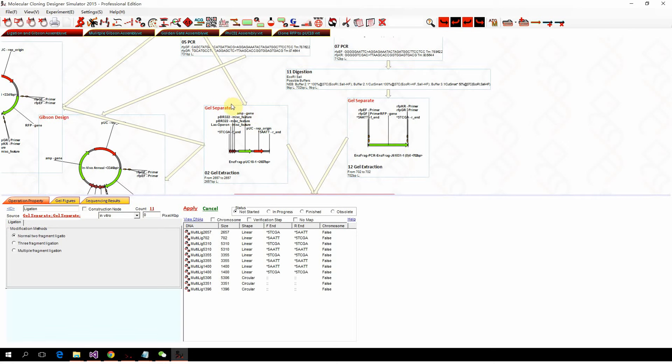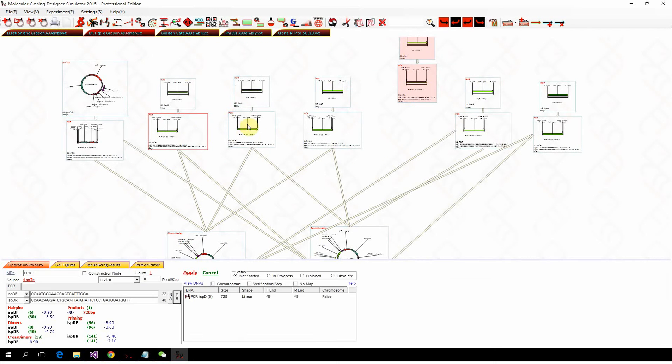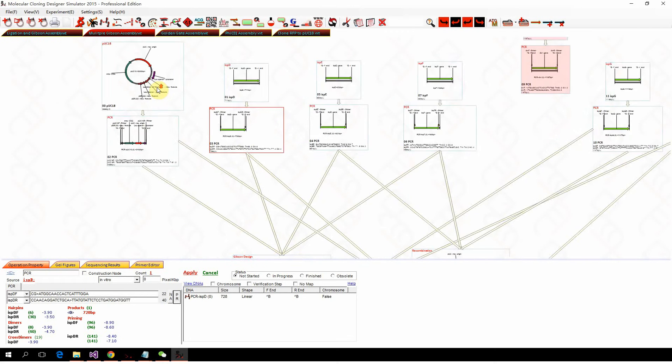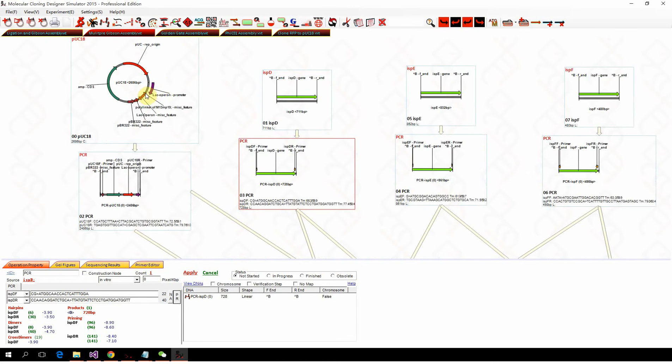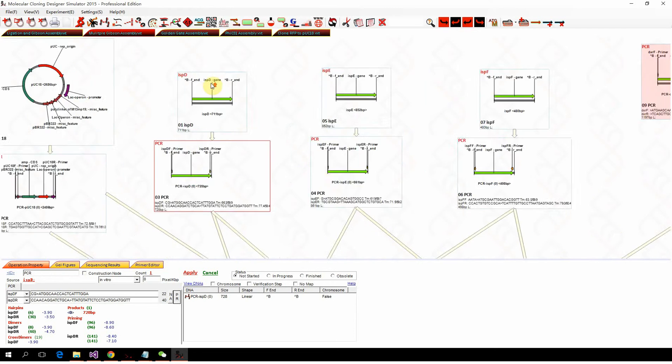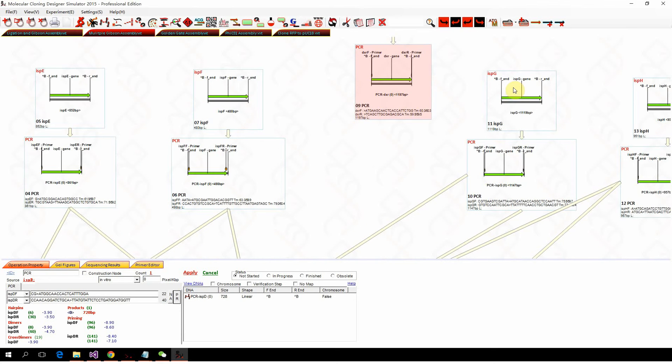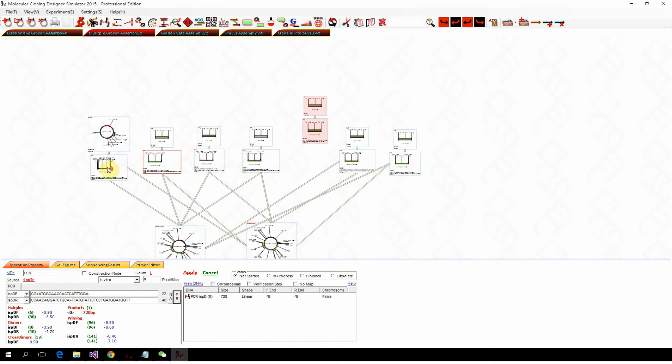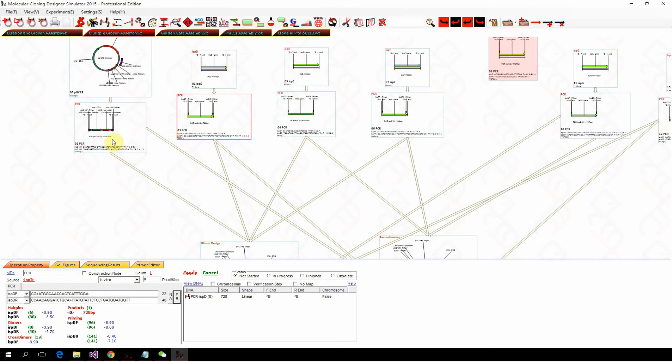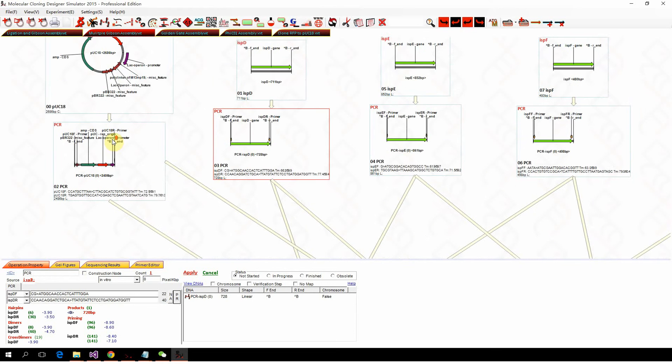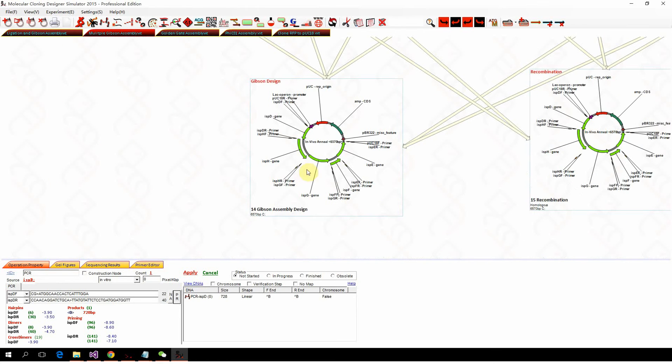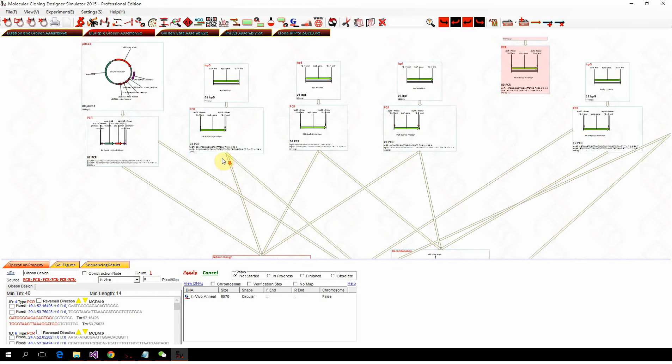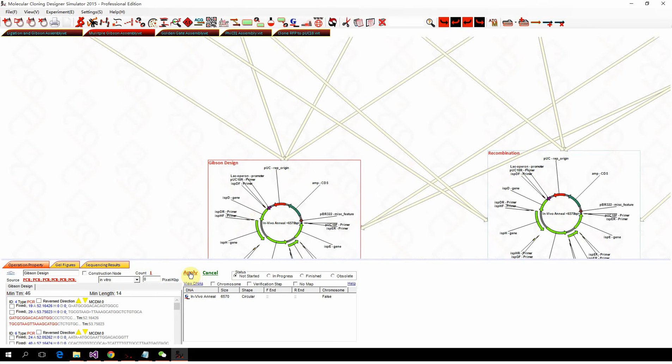Normally when you do Gibson assembly, you can also do multiple fragments. For example, this is a simulation of six fragments. We got six different fragments from E. coli genome. To save time, I already designed the primer. Here is the Gibson design, by just clicking the Gibson design.